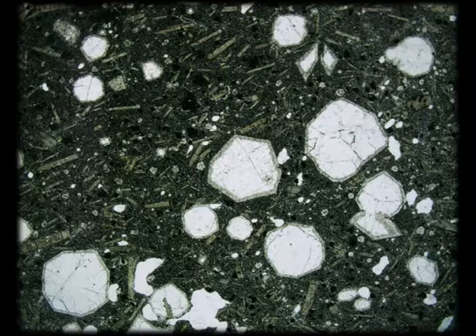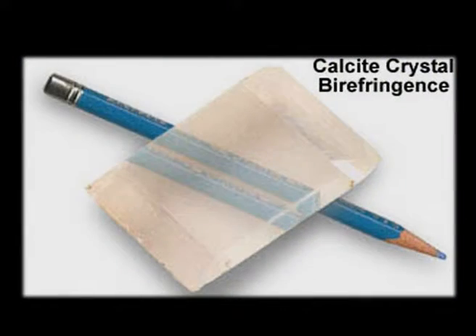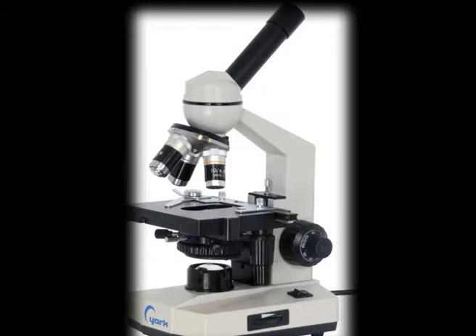So let's take an example. In isotropic substances, when light enters, it will get refracted in a similar manner from each of the faces. But in an anisotropic substance, where there are some changes in each of the faces, the refraction will not be similar from each face. Now, this can be utilized in biology. If there is any inherent anisotropy present in any biological substance, especially substances present in the membrane, then it can be observed by using light which is polarized.